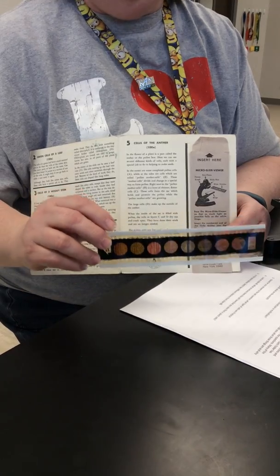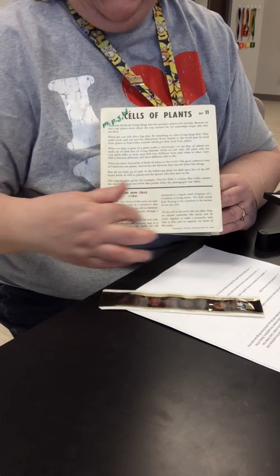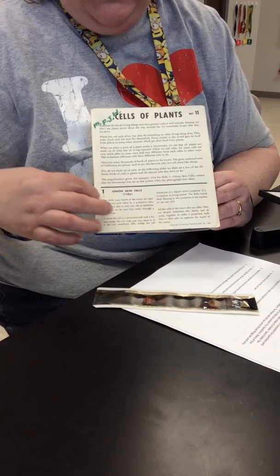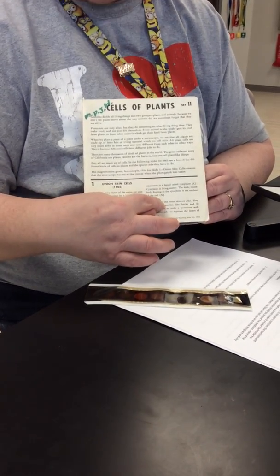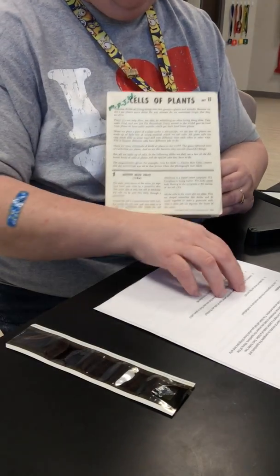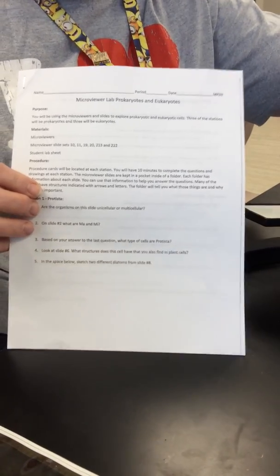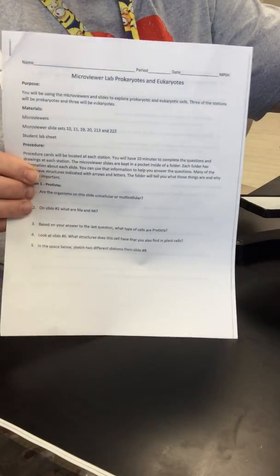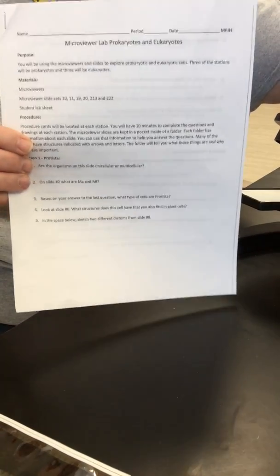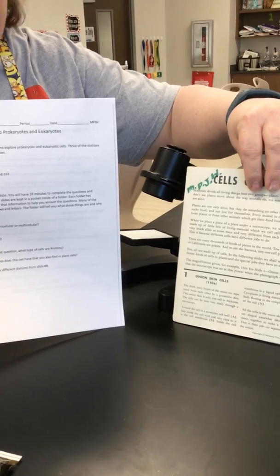On some of the slides they've even labeled things with an A, B, or an arrow. When you read through the material it'll tell you — like this onion skin cell — where the nucleus is, and it's labeled with an N. As you're working through each station on your lab sheet, you'll see some questions, and between what you see in the viewer and what you read on the folder, that will give you the answers. The information is here — you will have to do some reading and some looking.